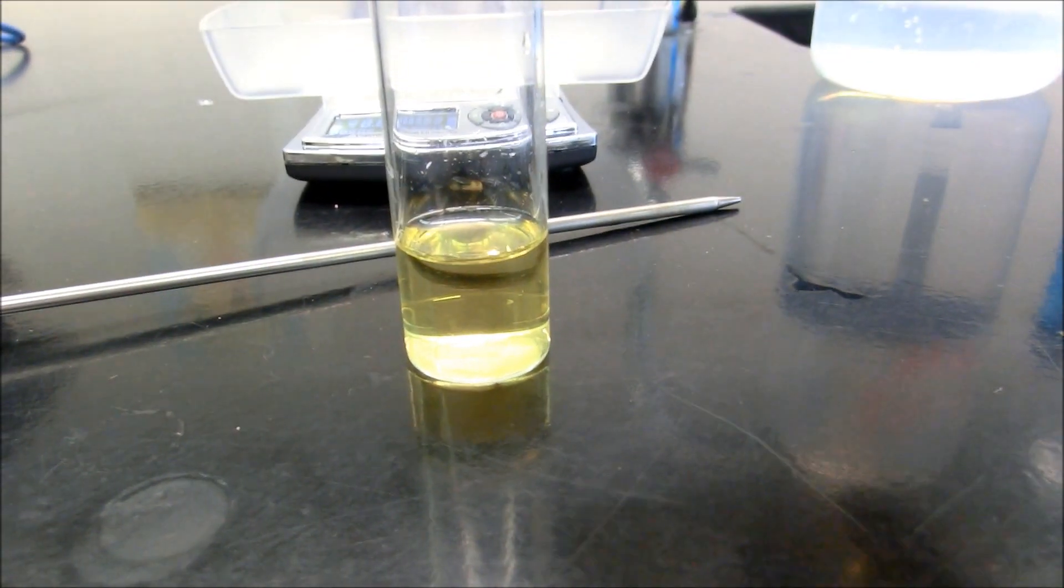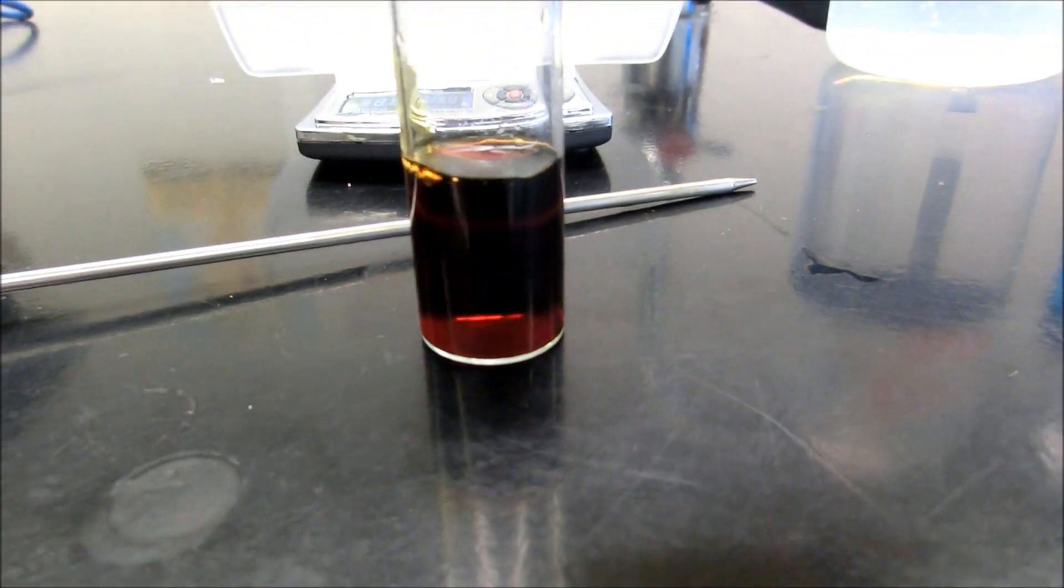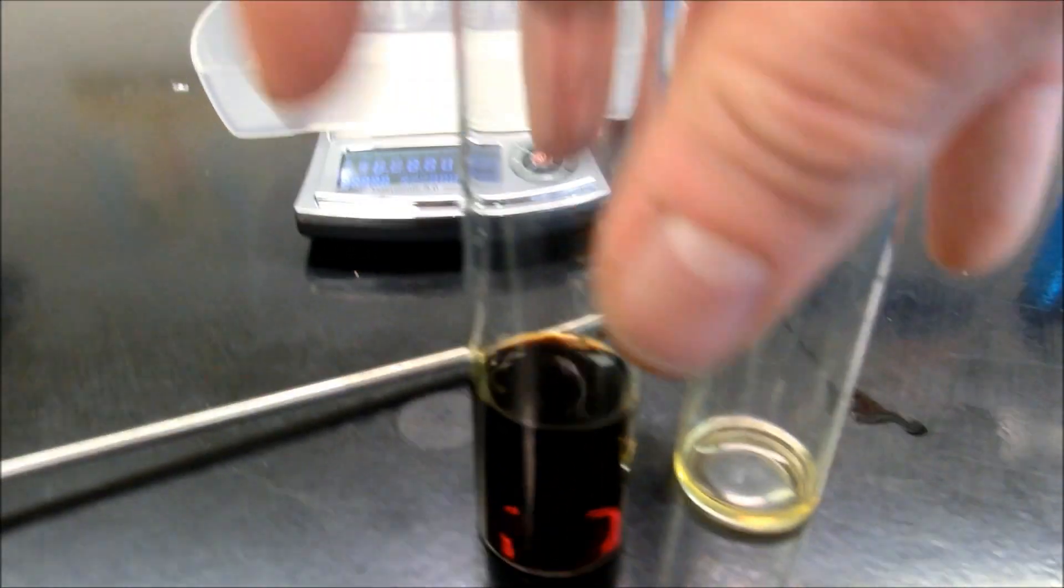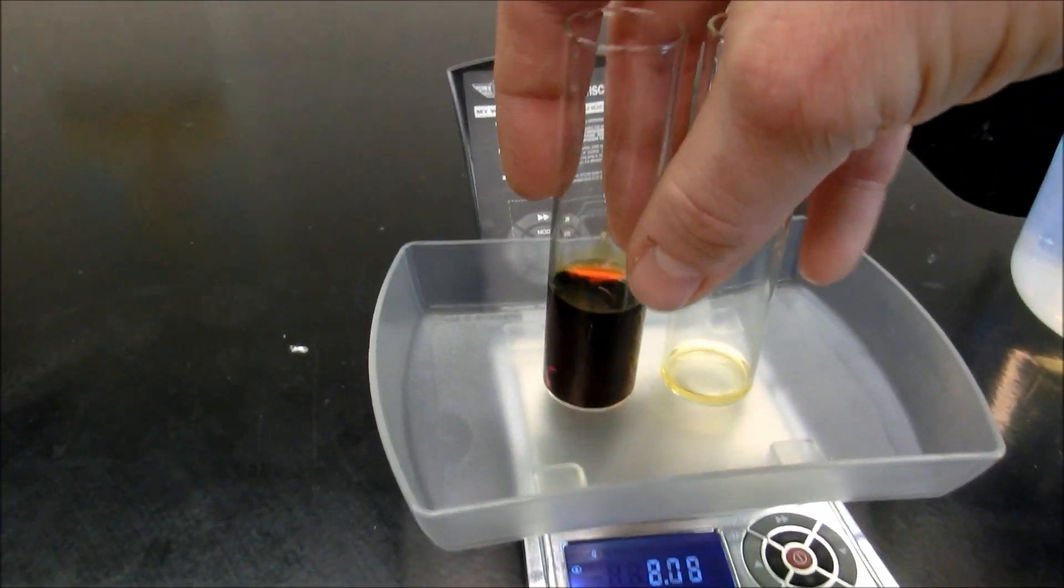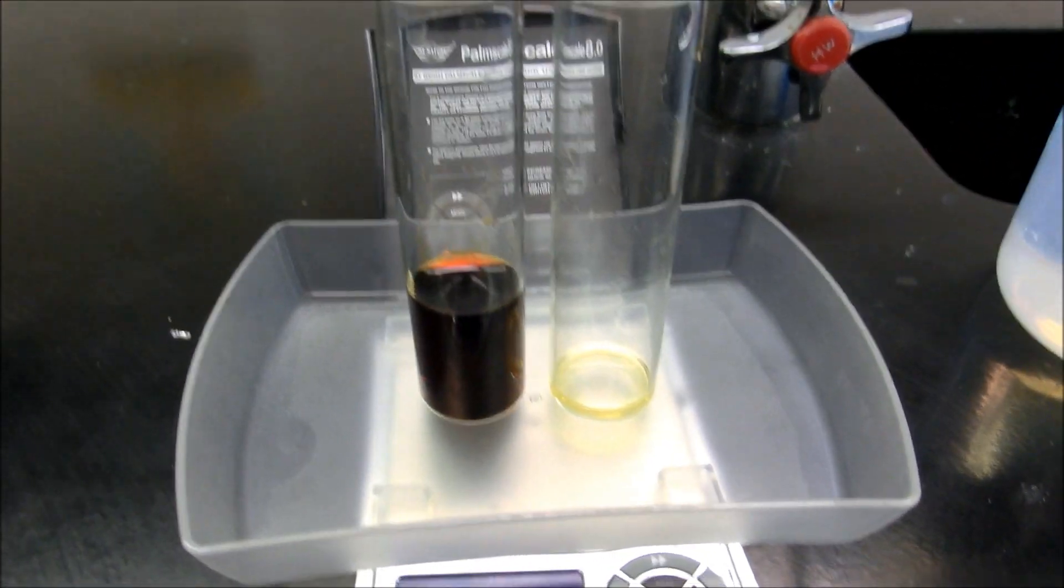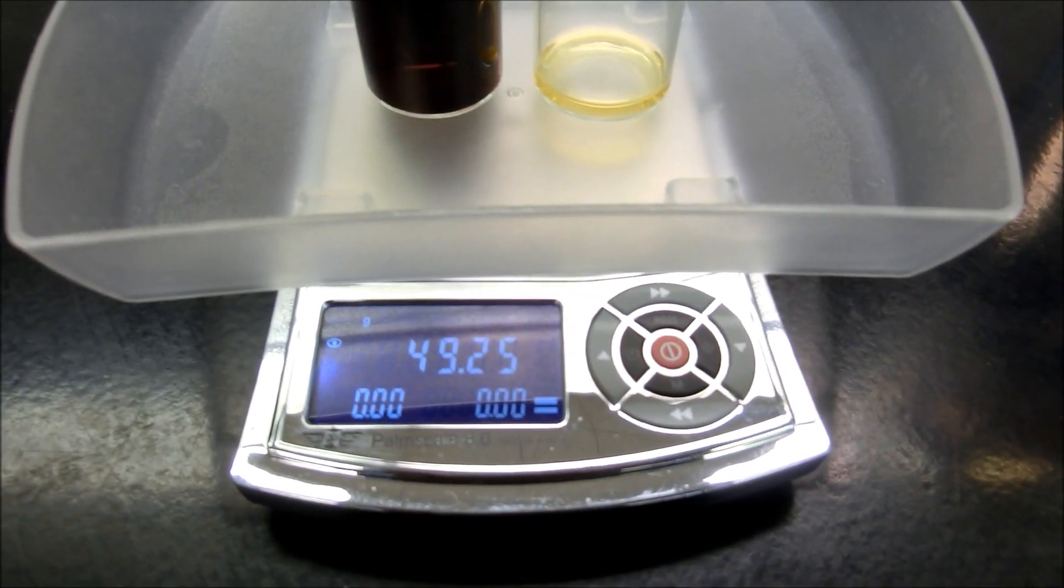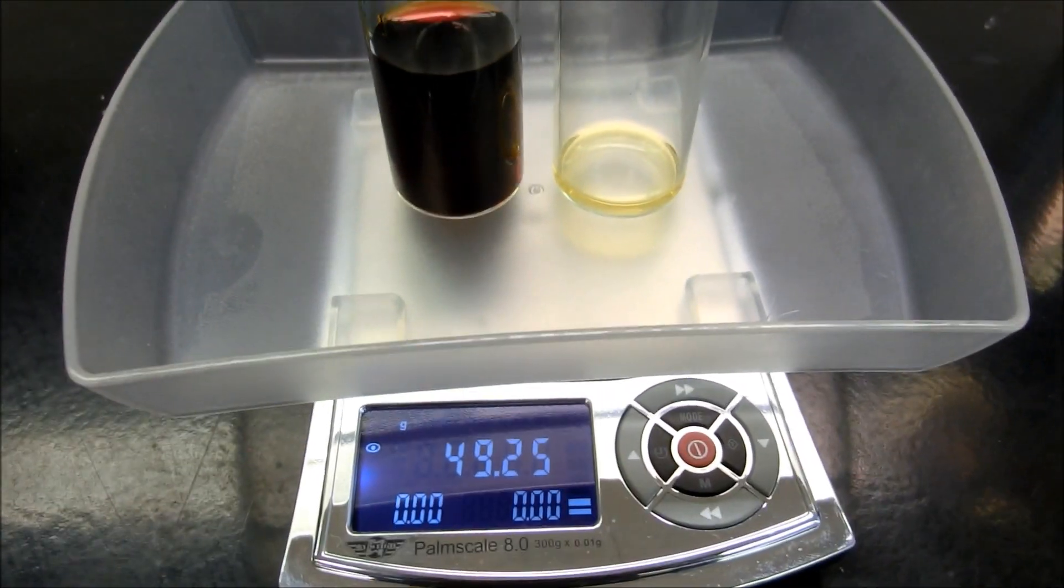Taking a look. I'm going to pour the iron nitrate. And we get that really dark, rich red color. There does not appear to be any solid in the bottom of that though. And we now have a mass of 49.25 grams.